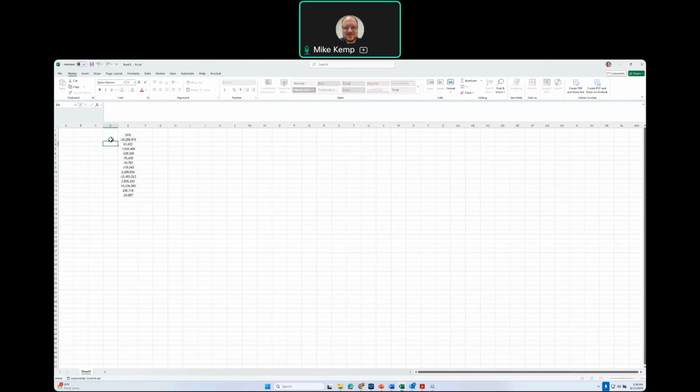So this is 1, 2, or wild type packet cells, and different clone numbers. A couple of extra digits there. So that's the expression.